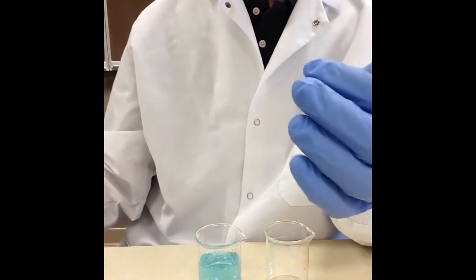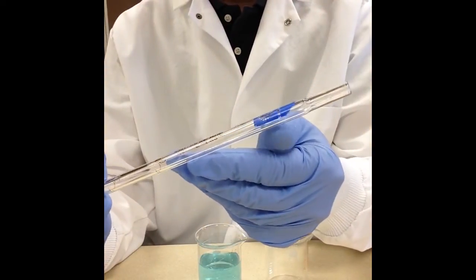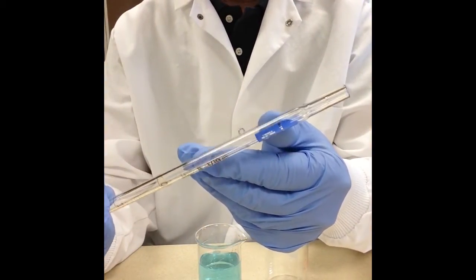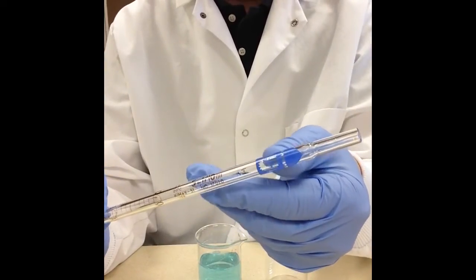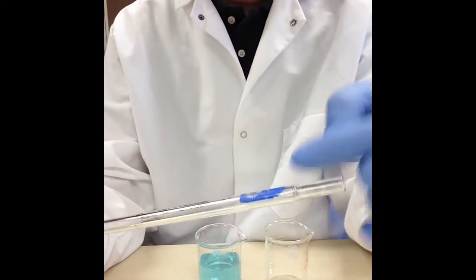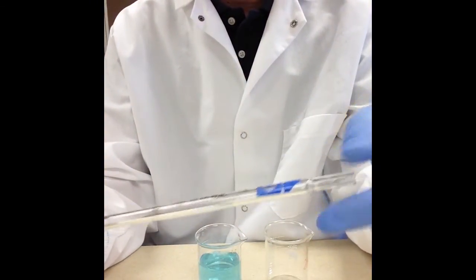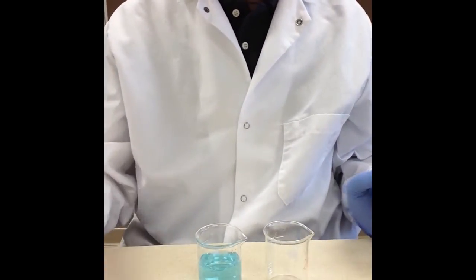What these tell us is that these pipettes need to be blown out. So don't be confused when you see a pipette that has these types of markings, you know shapes or colors. This does not mean that this pipette is to be blown out. If it's to be blown out the etched ring or the colored ring should go all the way around the top.